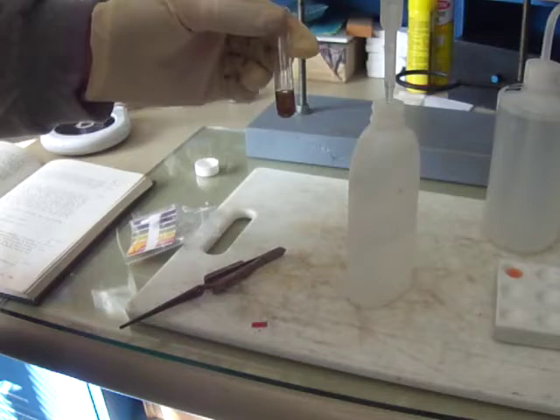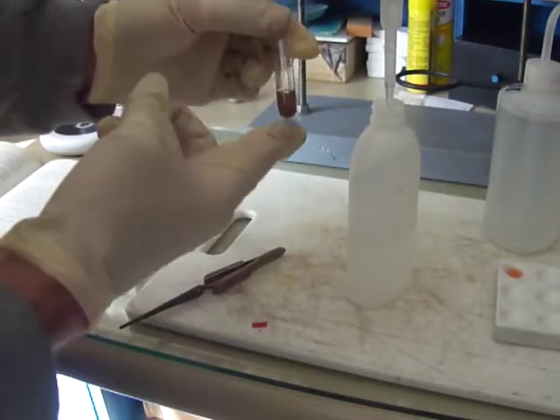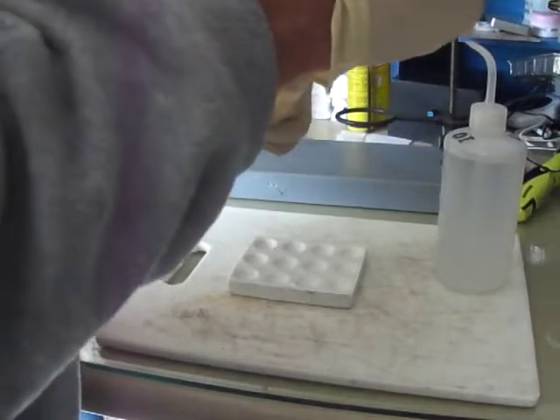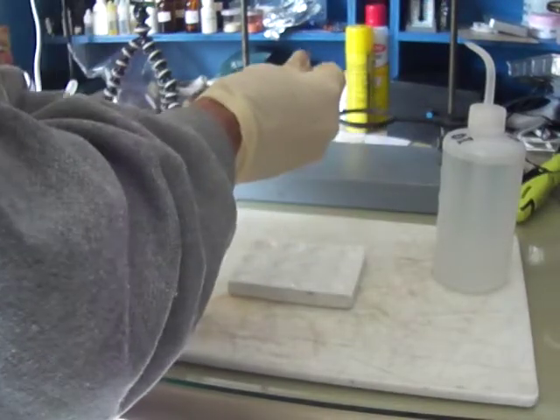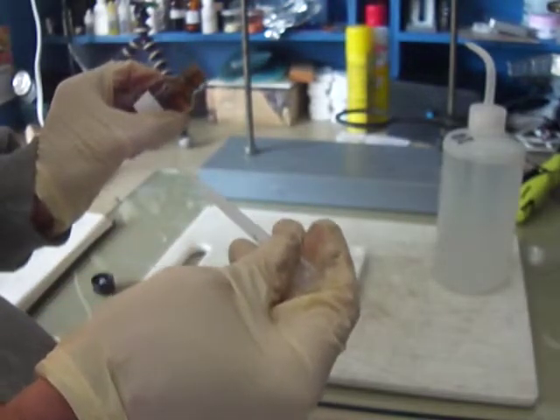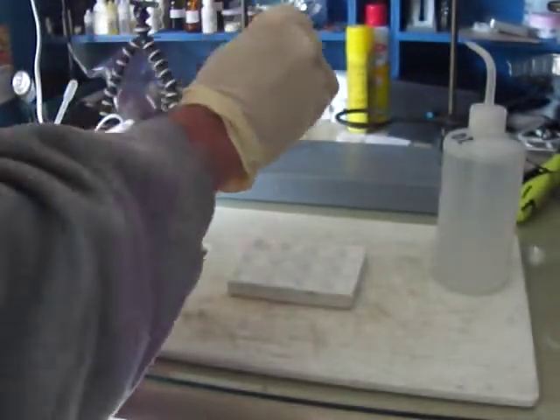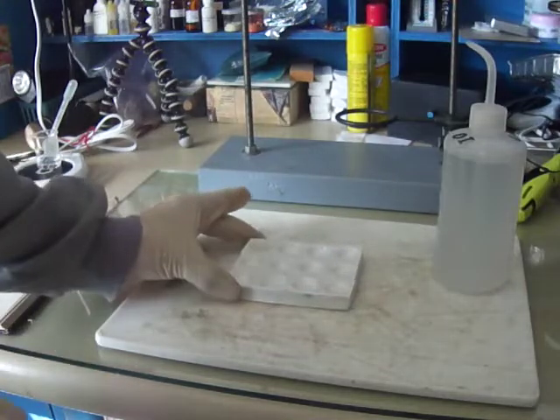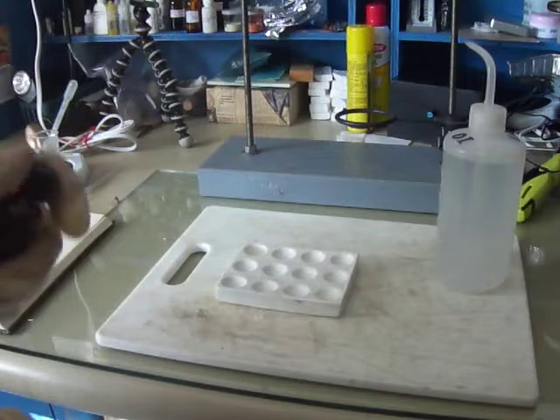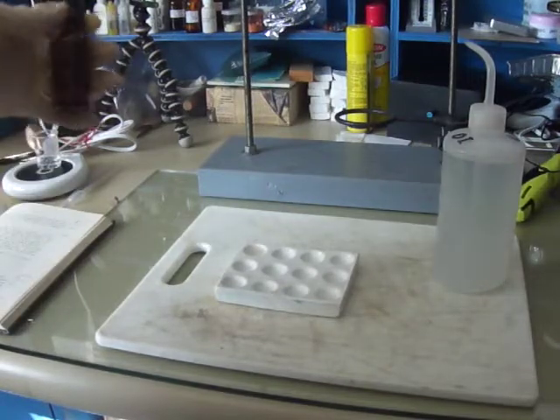Alright, once we have it basic, we're supposed to centrifuge out any iron and manganese there. Now that we've centrifuged this, we can go ahead and do the nickel test. We add dimethylglyoxime to it, just a drop. Alright, we're supposed to let that stand, and we should get a strawberry color to it, but we're not getting anything at all, so there's no nickel.